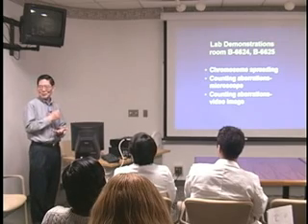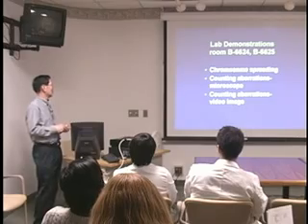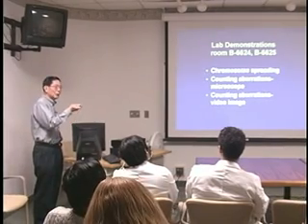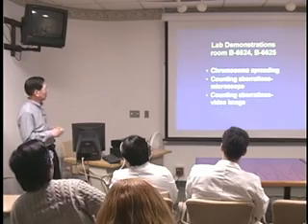Although we don't grade you, we can take a look at your final product and say whether you did a good job or not. But at least you get that experience to see if you can get a good chromosome spreading or not. Ying will be the one to show you how to do it. Then she will provide you with prepared samples to do it.